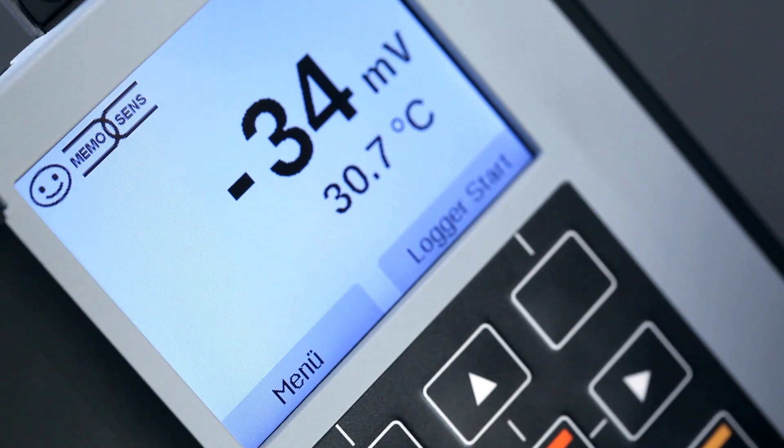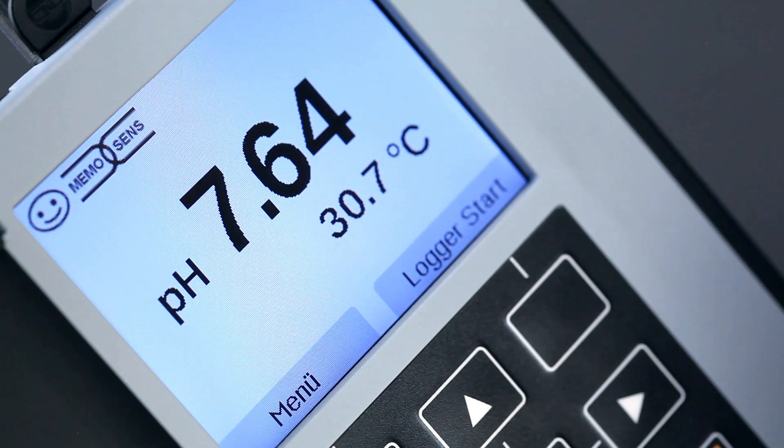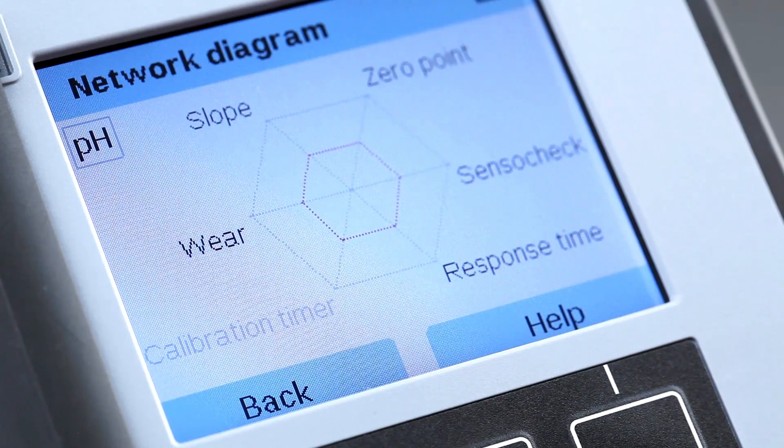Clear and intuitive operation. Measurement display with time and date. All information on the sensor at a glance.